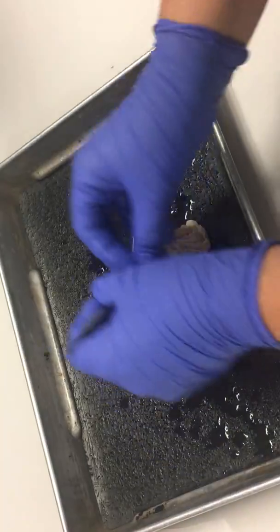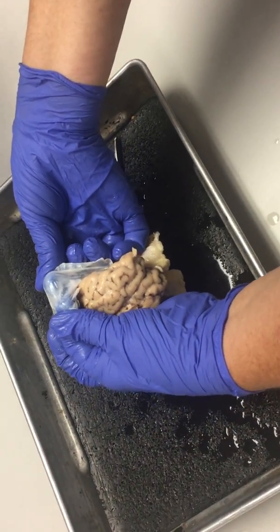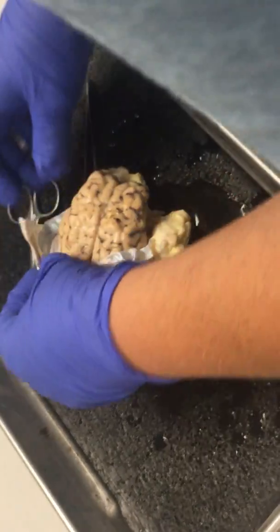Let me cut the rest of this — cut down the dura mater. And just so you appreciate how tough the dura mater is, I'm going to try to break it with my fingers. I can't. That's my finger moving on it. It's not breaking.